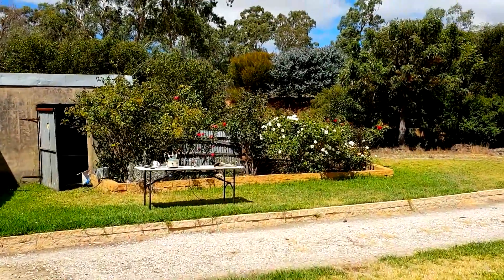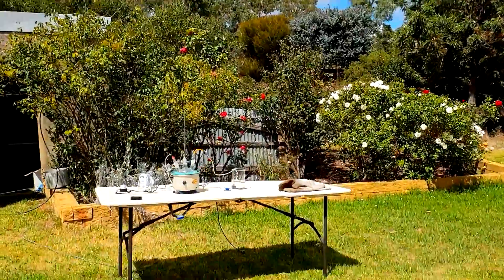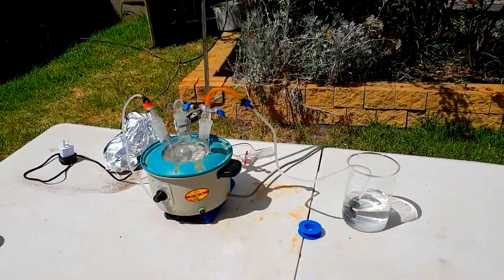Hello, so today we're going to be working with my least favorite gas that I've ever dealt with, and that's ammonia. I hate the smell, I hate dealing with it, it's just a bit of a shit.